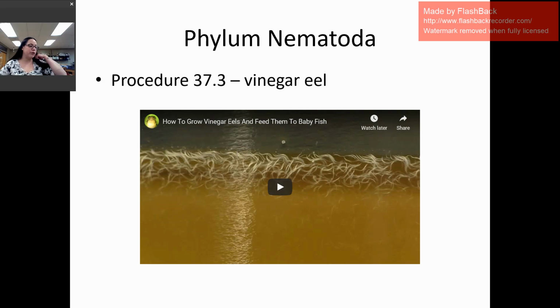So in procedure 37.2, I left 3 here, but I meant 2. They ask you to look at different living nematodes, and we are going to look at the one that is called vinegar eel. In your book, they put the Latin name, and it's Turbatrix. Okay, so that video, I'm not going to play all of it. What I want you to look at are all of those little white things, and those are all individual worms, and so those are called vinegar eels.